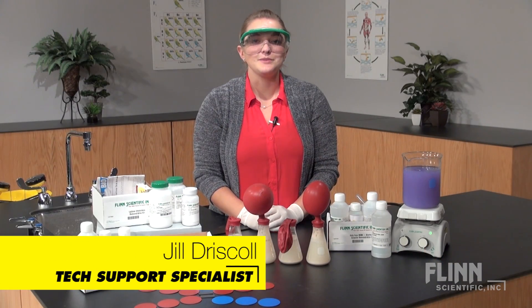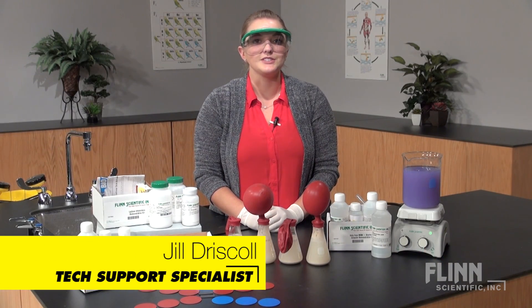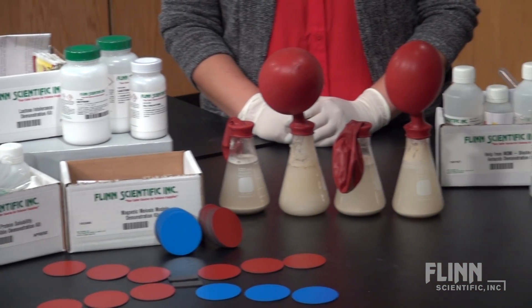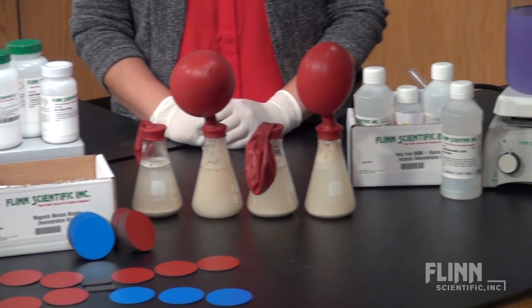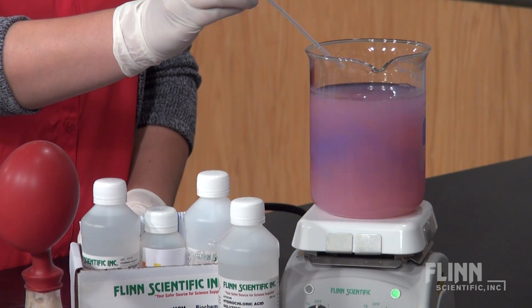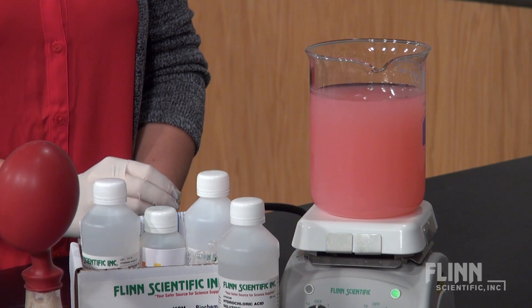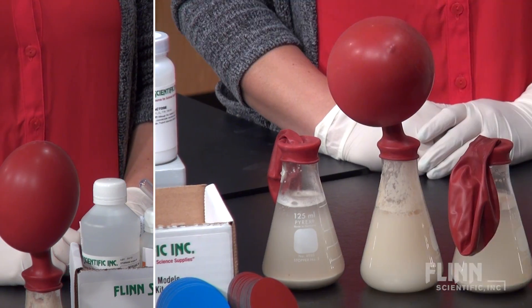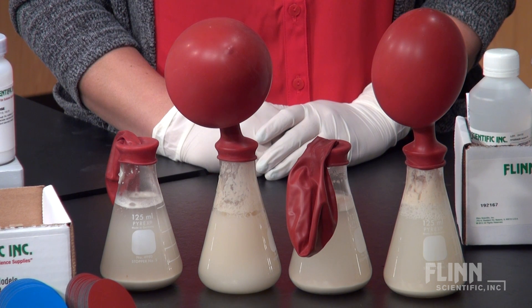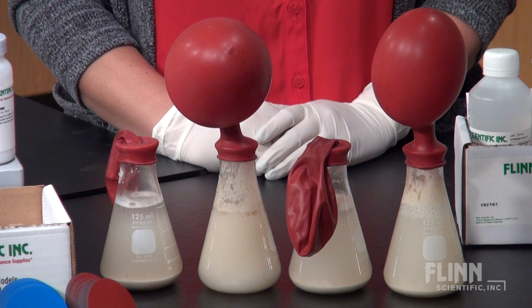Are you looking for a great way to begin class and really get your students interested in the material today and a month from now? Whether it's creating that wow factor or bringing theory to life, Flynn's demonstration kits for biology can help. Spark curiosity as students observe the colorful neutralizing effect of magnesium hydroxide on stomach acid. Watch as they try to figure out what is causing these balloons to inflate as lactose is digested.